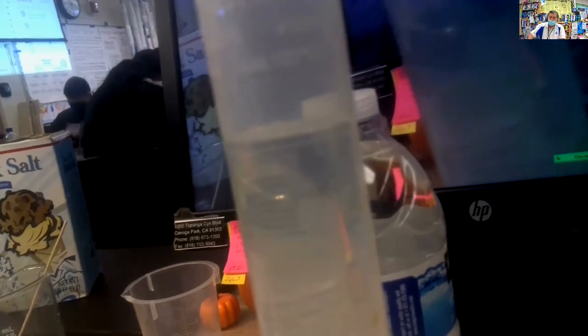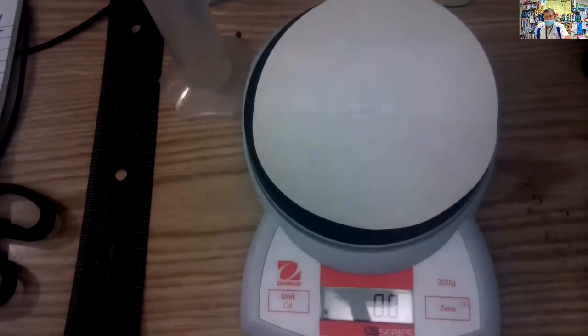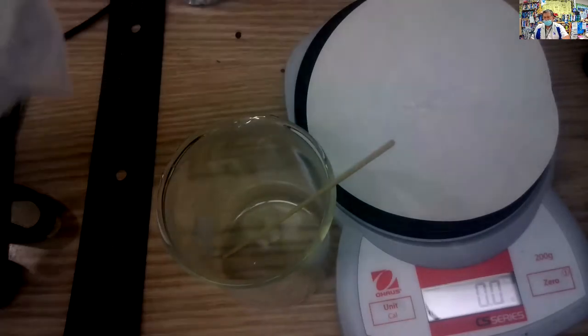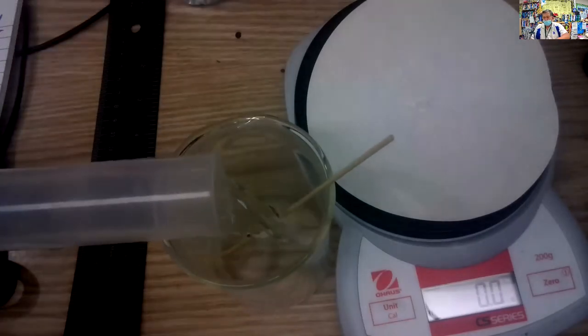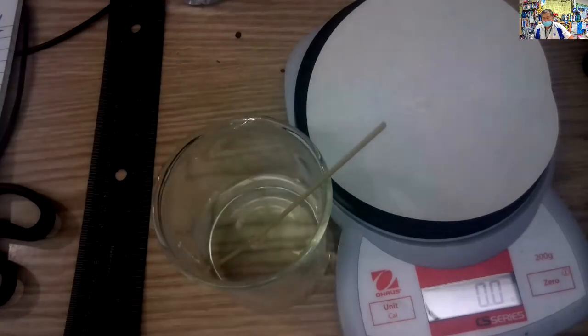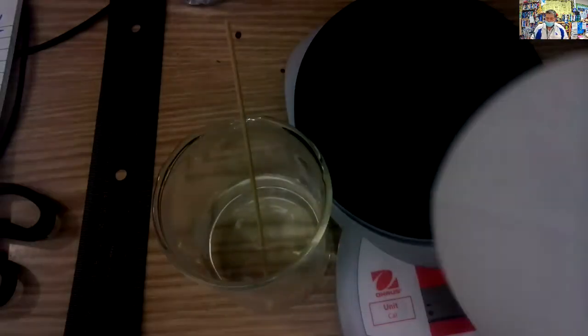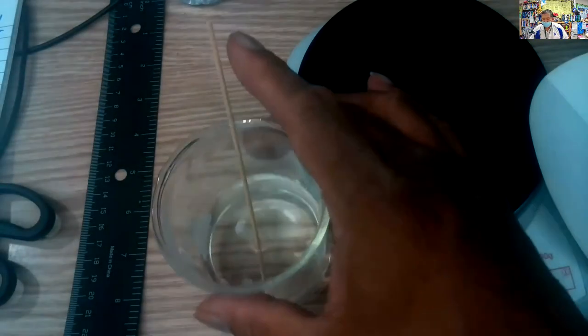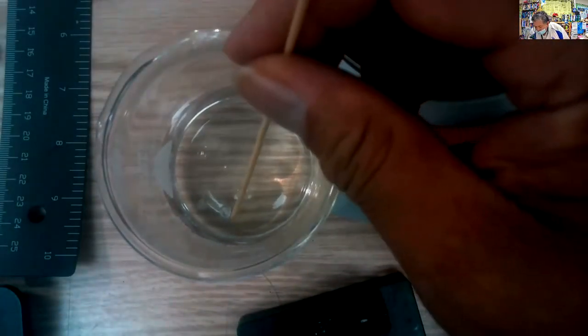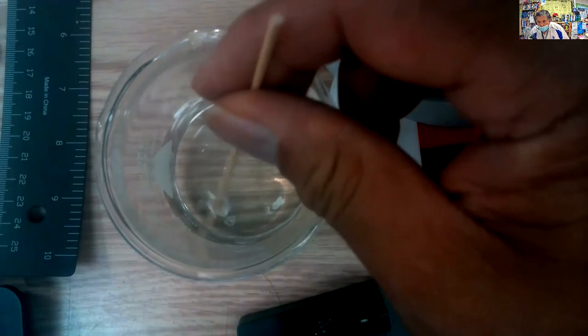So I'm going to take that 100 grams and I'm going to put it in a beaker. So I have a glass beaker here, and I'm going to put 100 grams of water in the glass beaker from the graduated cylinder. I have a wooden stick for stirring purposes. I'm going to take the salt and put it in there. You can see it's hardly any salt at all. But now, if you can see at the bottom, you can see that it is going to need to dissolve.